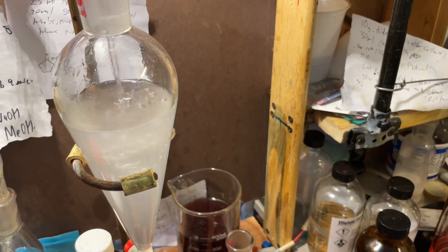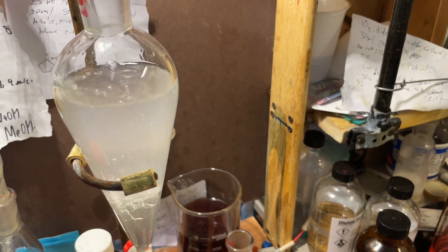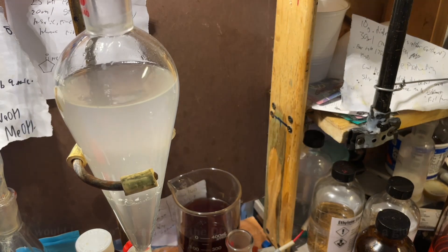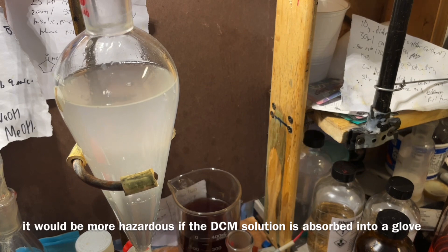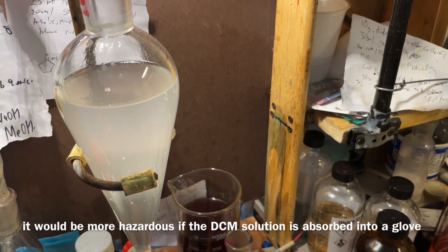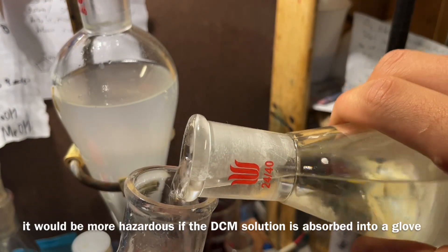It is toxic, but last time I handled it I got it on my hands and I'm fine after I just washed it off with some soap and water. It's not like crazy toxic like cyanide. The things I will not work without gloves — or just at all — are cyanide, and also lead and mercury and stuff that accumulates.